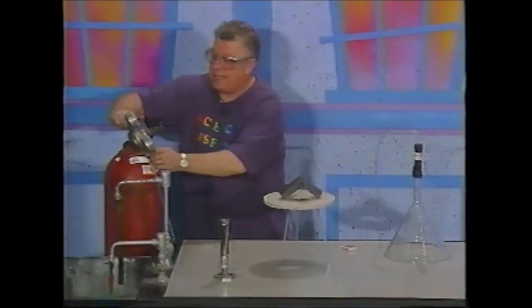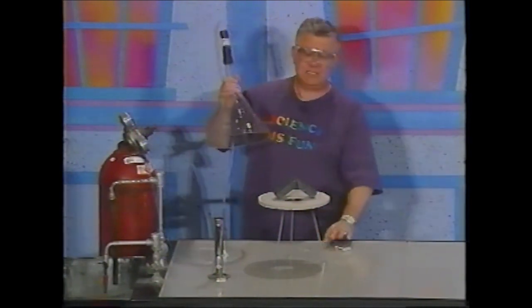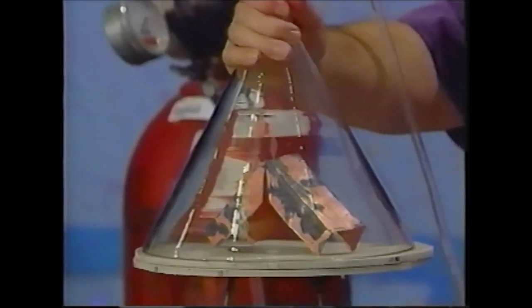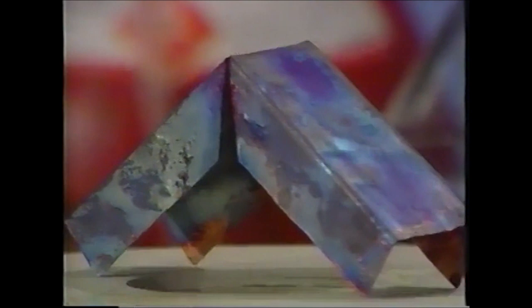So I'm going to turn the gas on, and you can hear it flowing. I'm going to bathe this hot piece of copper with hydrogen gas. Hydrogen gas combines with the copper oxide to form water and copper. I take the hydrogen away, I get copper oxide. Put the hydrogen back in, and I get copper.